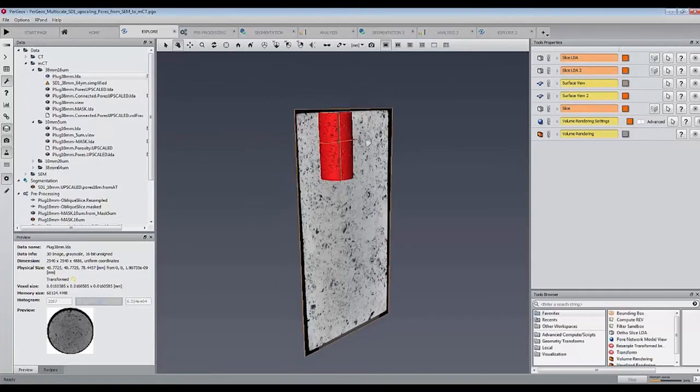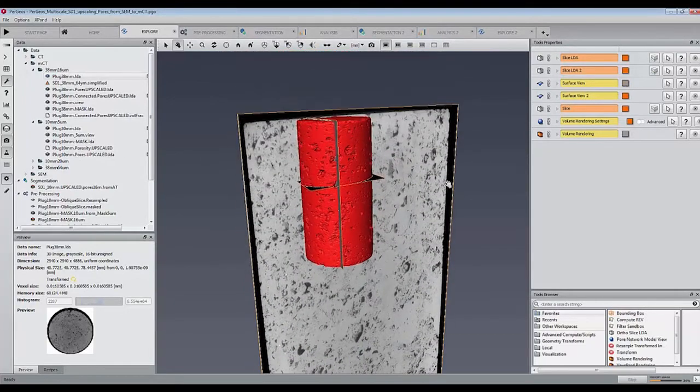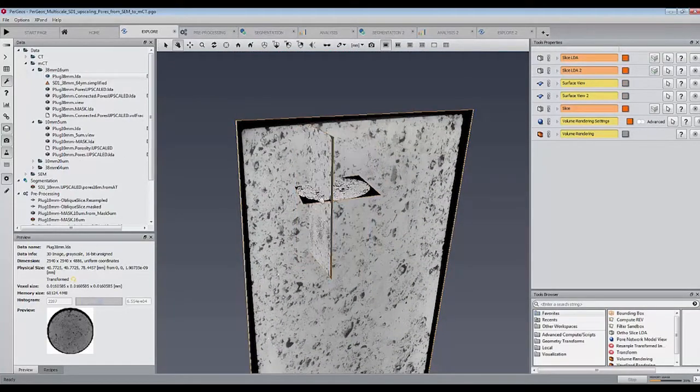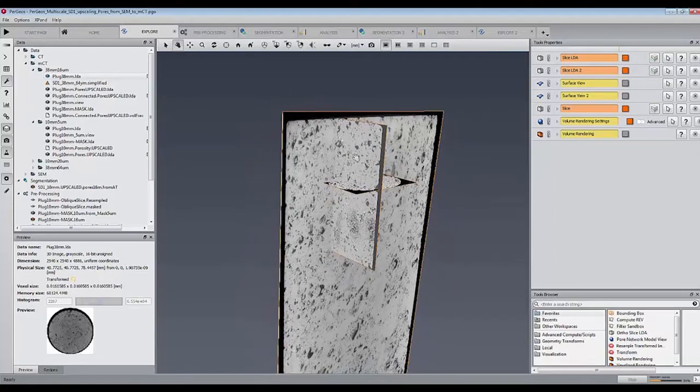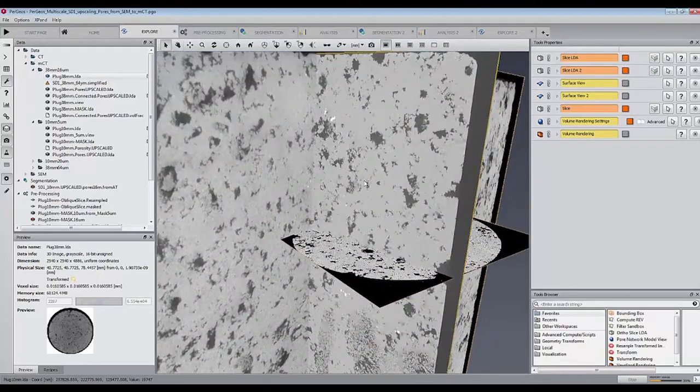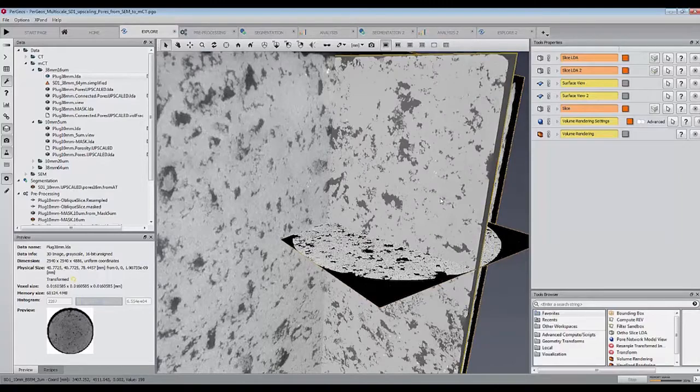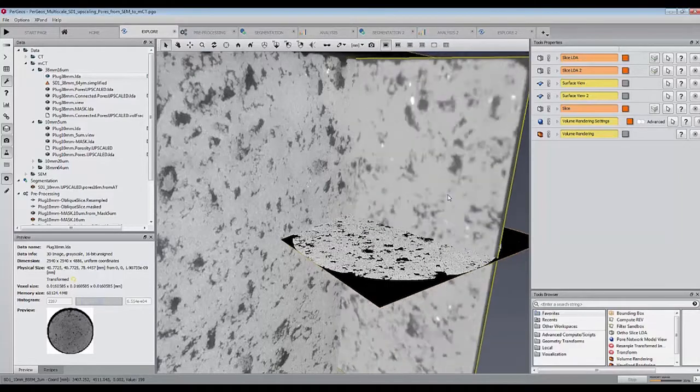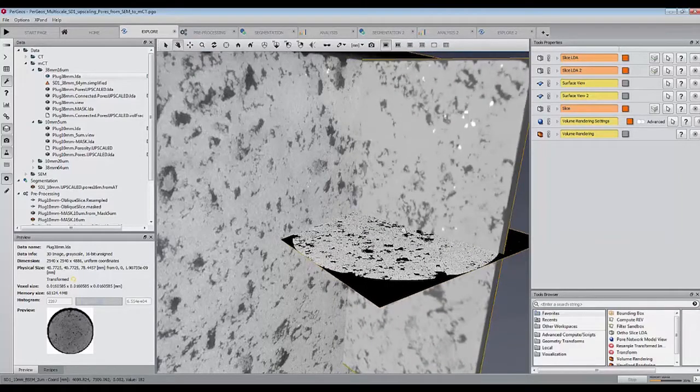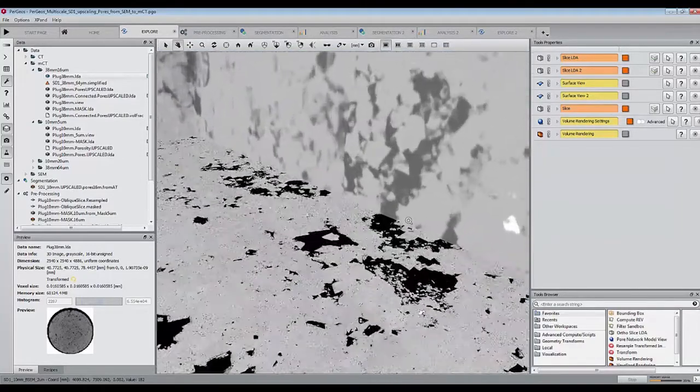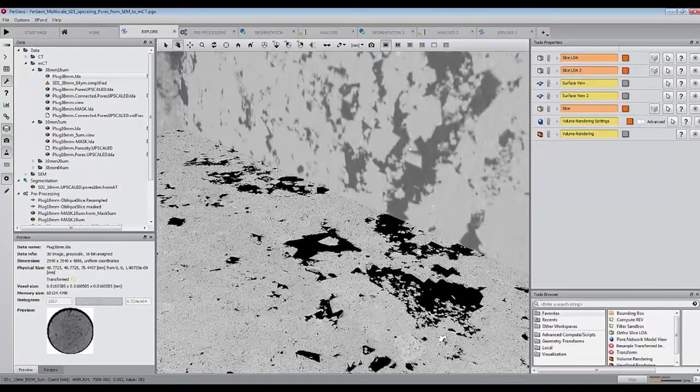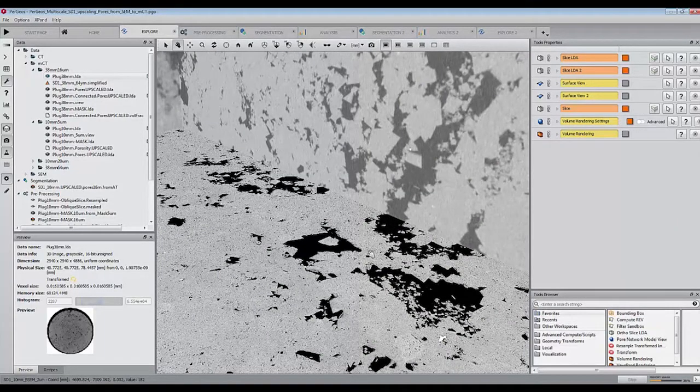We have here the big plug scanned at 16 microns, a small plug scanned at 5 microns, an SEM slice acquired with a 2 micron resolution. All have been registered, 3D to 3D for the two plugs, and 2D to 3D for the SEM and the 5 micron microCT.